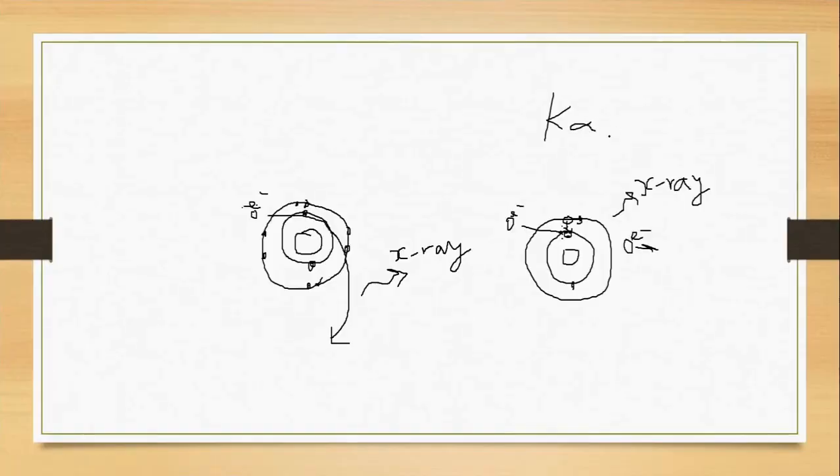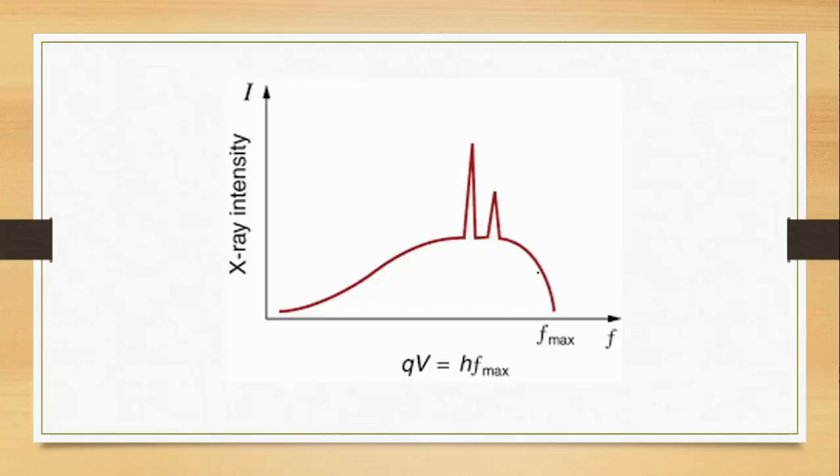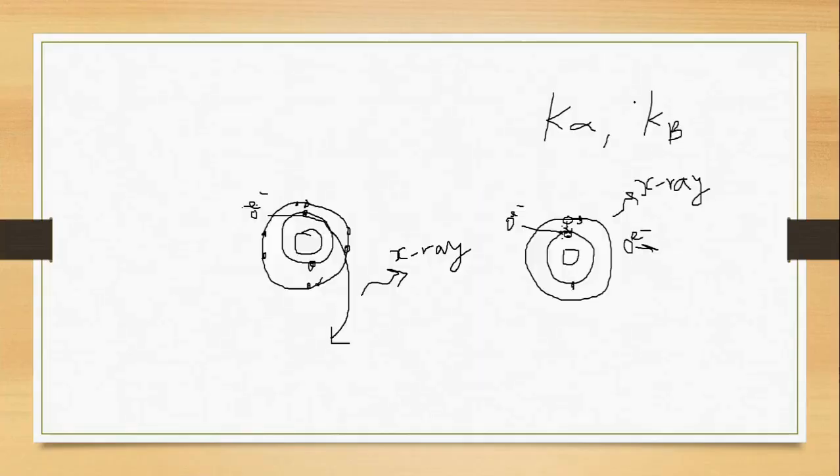K alpha and the other one is referred to as K beta. So from this picture, usually K alpha would be somewhere here, and K beta would be somewhere here. So there you go. And K alpha has two components, K alpha 1 and K alpha 2, but normally in the case of XRD, we go for K alpha 1. This is more in the analysis part.